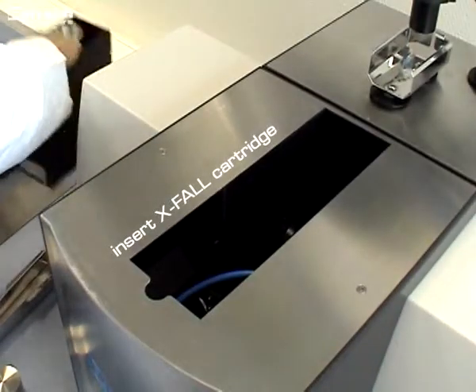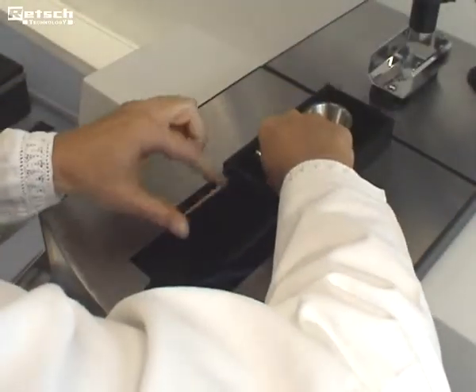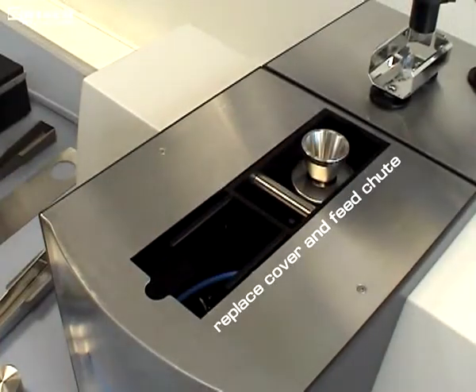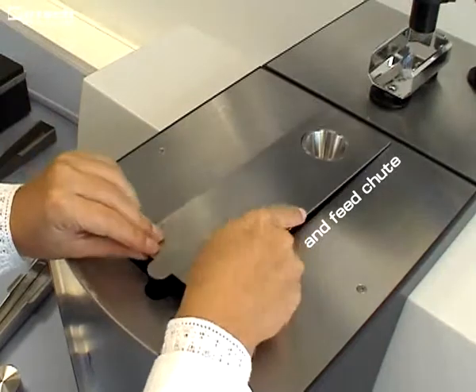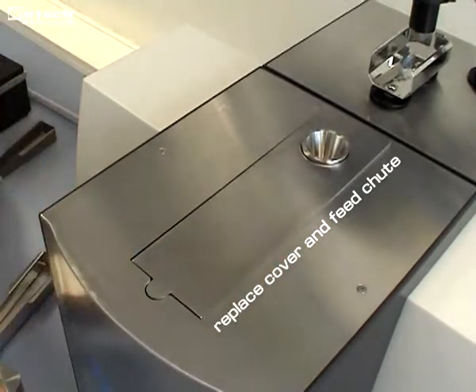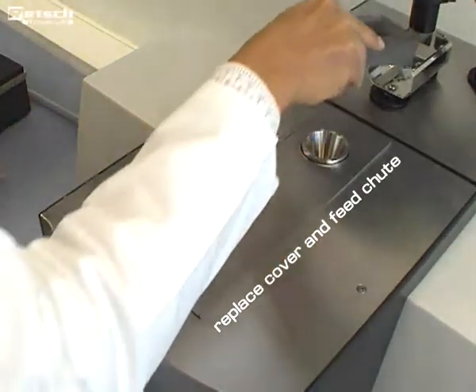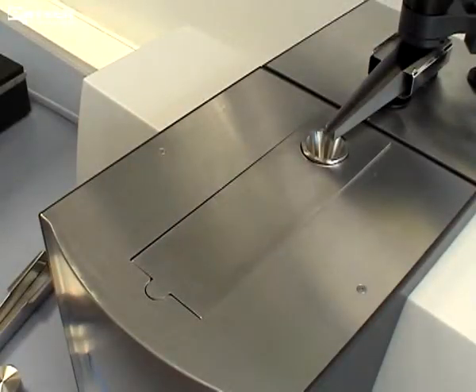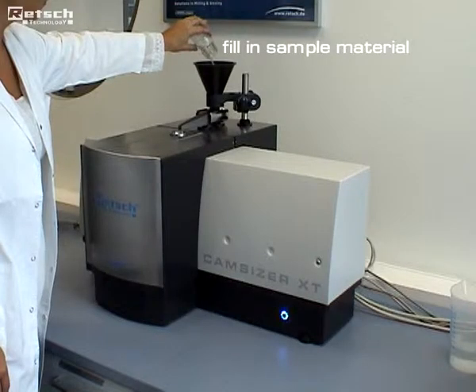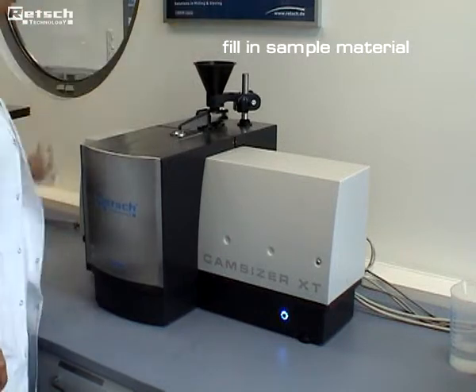The X-Fall cartridge is inserted and is automatically centered in the correct position. The conversion is finished by replacing the cover and feed chute. The software automatically recognizes the new cartridge and selects the corresponding settings. The measurement can start immediately after the sample has been added.